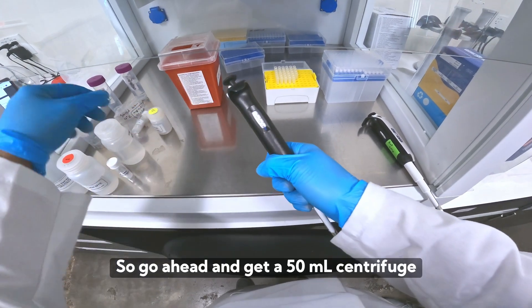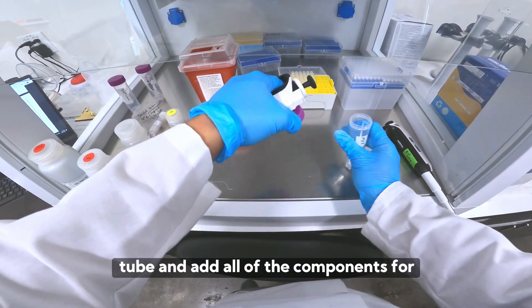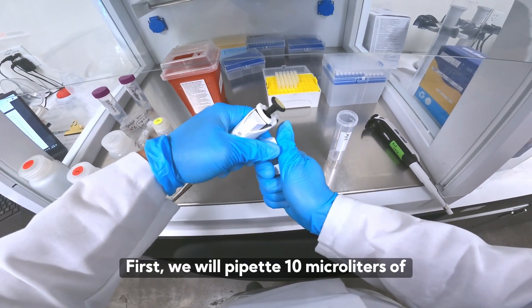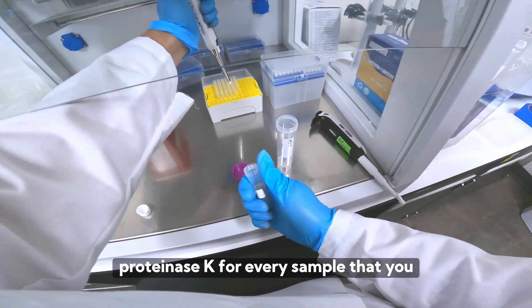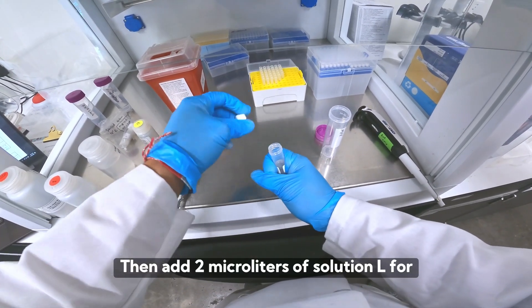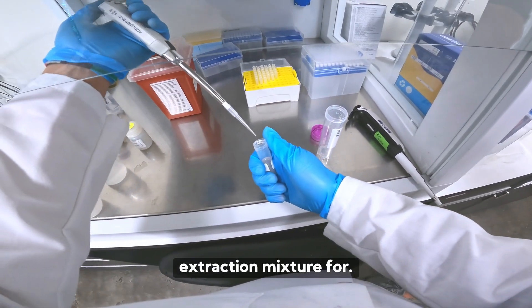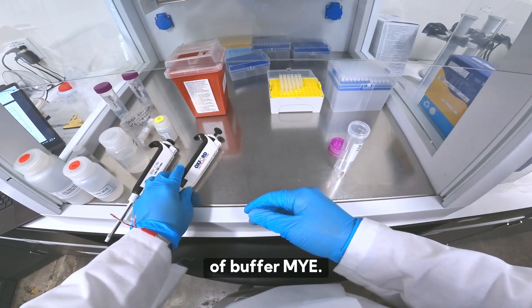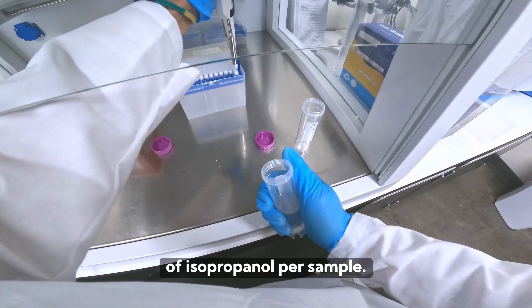Get a 50 mL centrifuge tube and add all of the components for the MYE plate into it. First, pipette 10 microliters of proteinase K per sample, then add 2 microliters of solution L per sample, 250 microliters of buffer MYE per sample, and 500 microliters of isopropanol per sample to complete the MYE mixture.